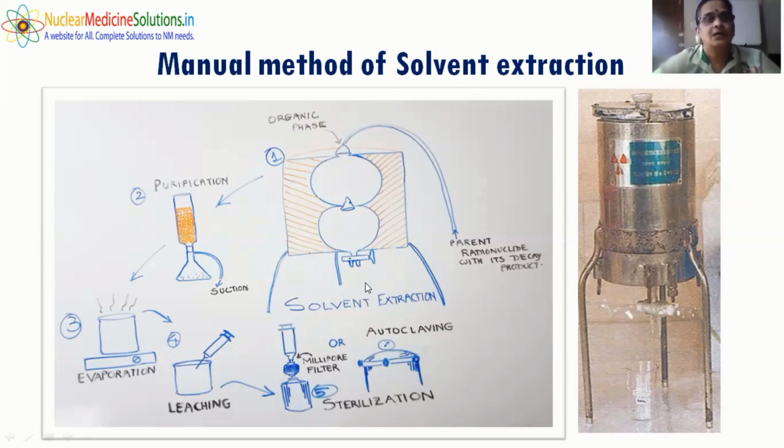Because it was all in lead shield, we could not see the actual separation, but from this lower layer, which was a little open, as you see here, we could see the level where the two phases separate, outside the lead shield. The second opening was used for the collection of the yield, which is in the organic phase, that is methyl ethyl ketone.